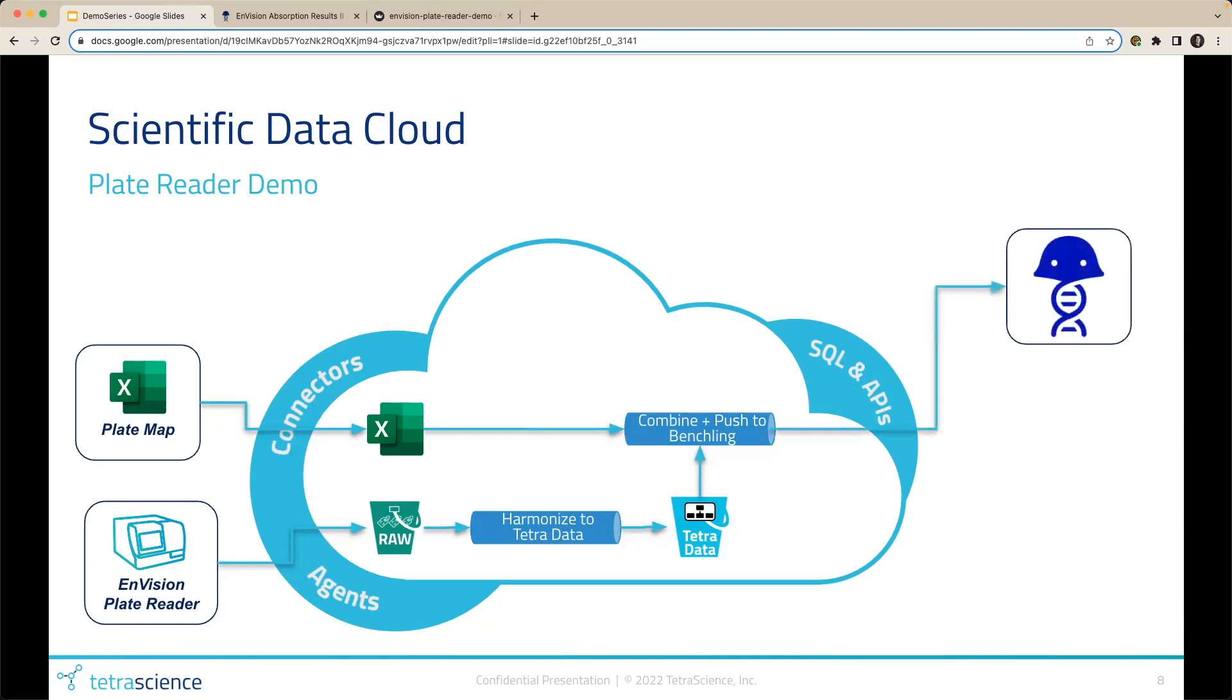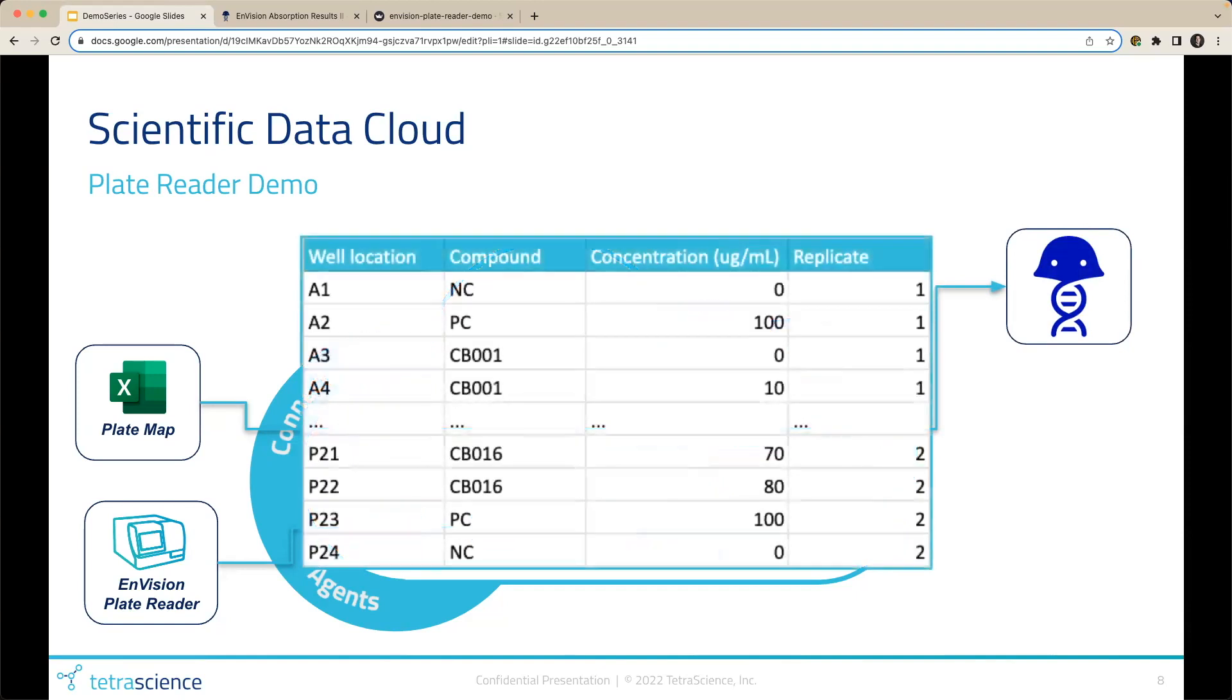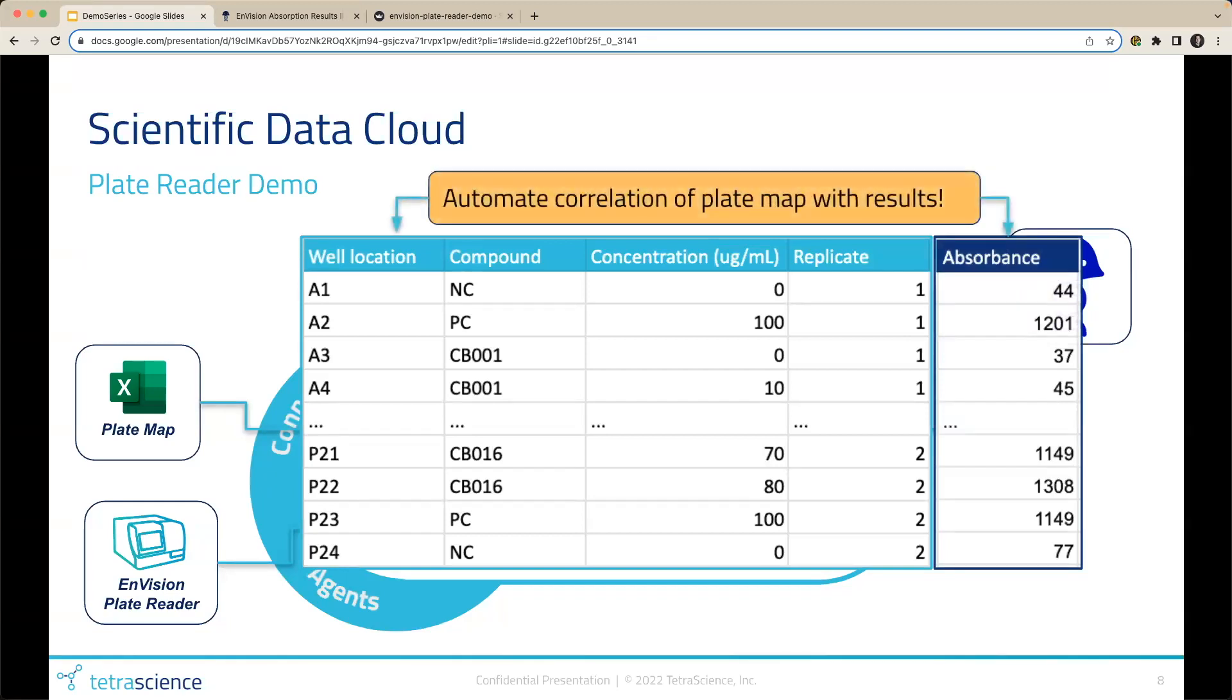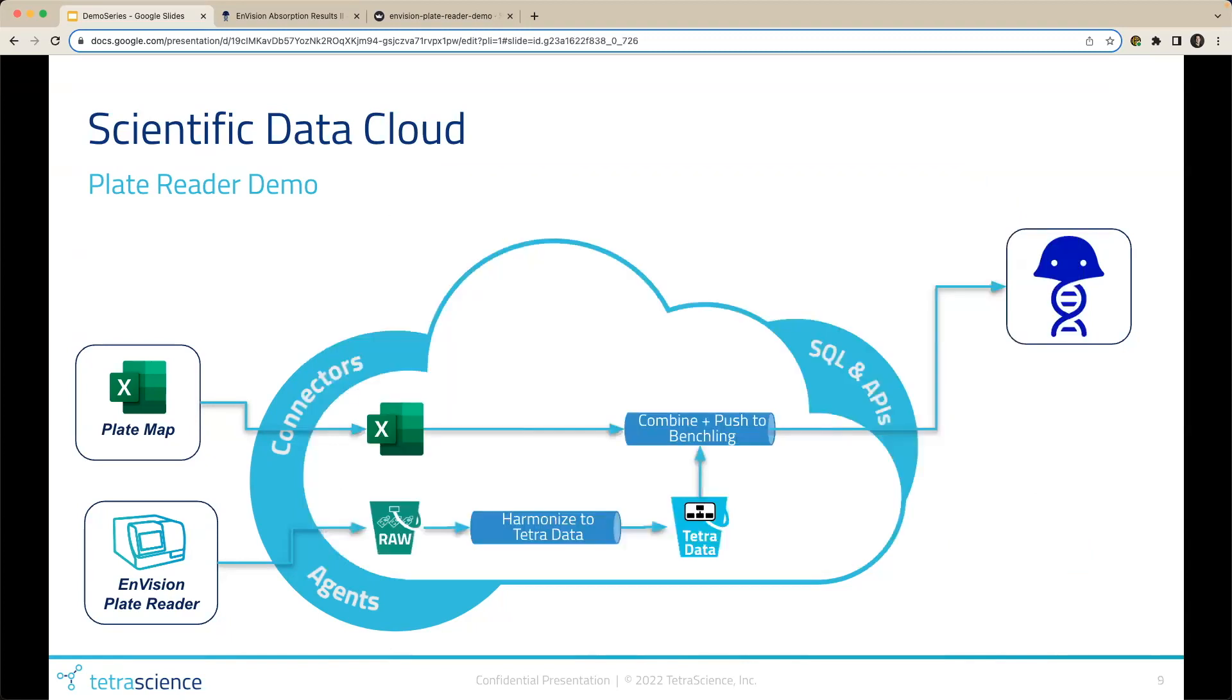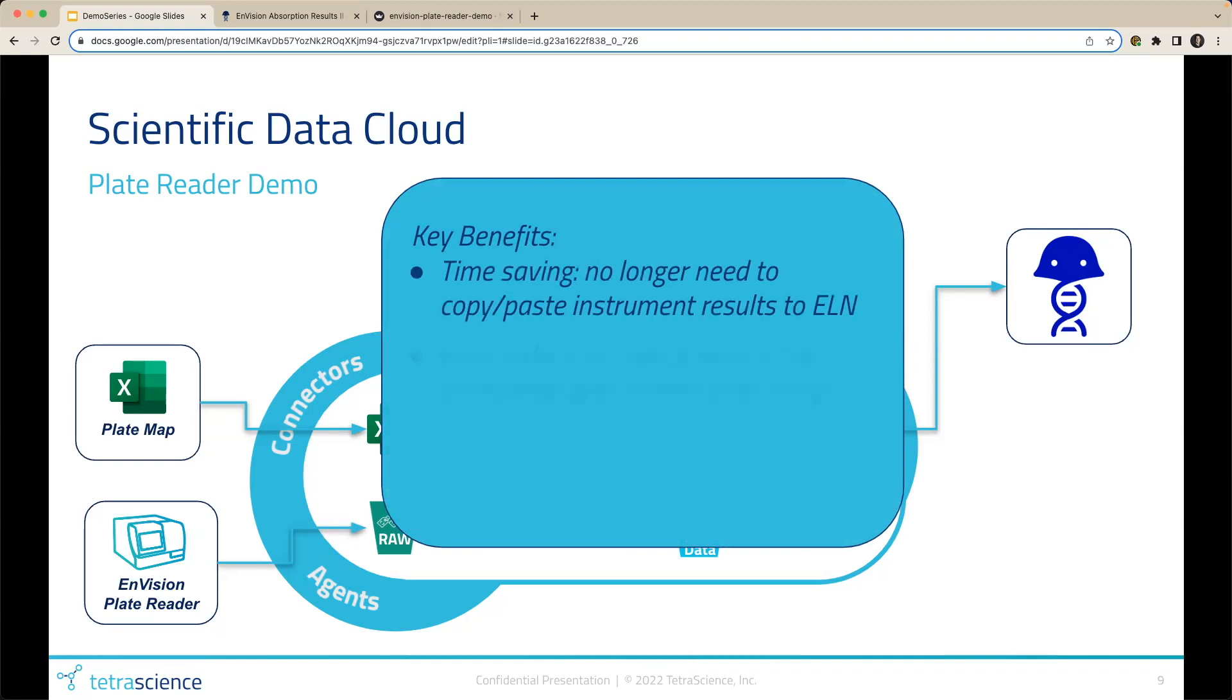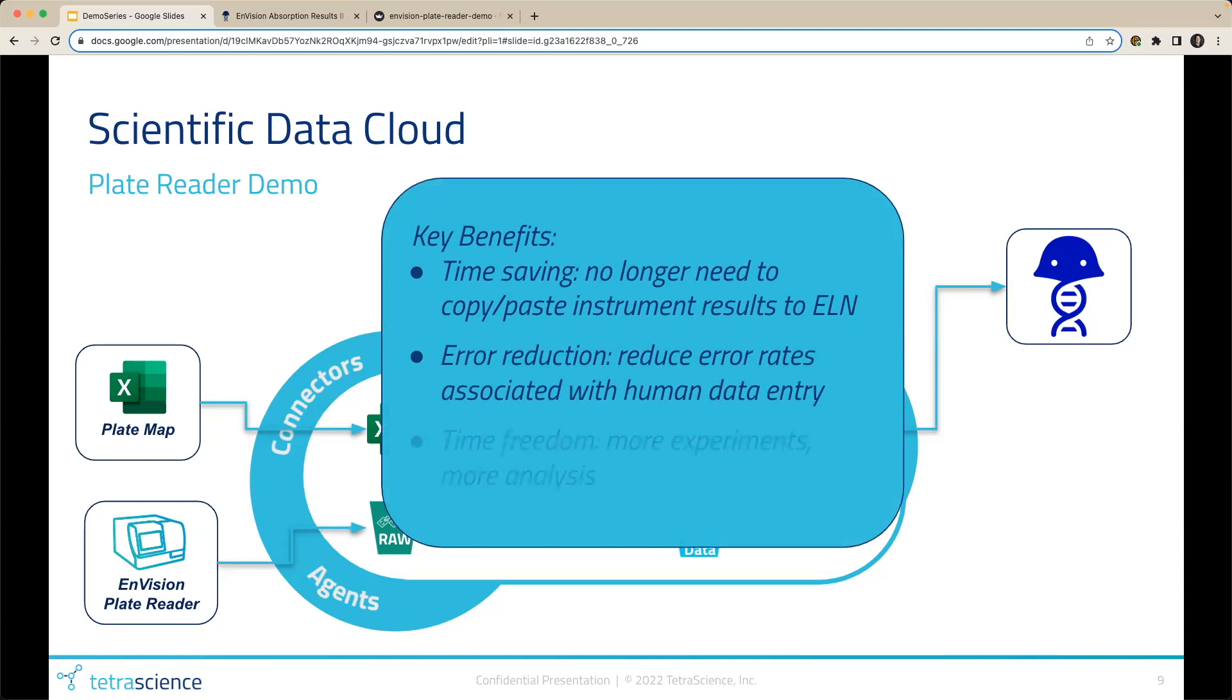Once the Tetra data has been combined with the plate mapping data, the platform will automatically send that associated data to the Benchling inbox for the scientists to consume. What we would expect to see in Benchling is our plate map, combined with the absorbance results of our plate reader data, all in one table and correlated together. Some key benefits of leveraging the Tetra data platform in this workflow are reducing the hours scientists spend copying and pasting data, reducing error caused by manual transcription, and freeing up time for more meaningful tasks such as experimentation and analysis.